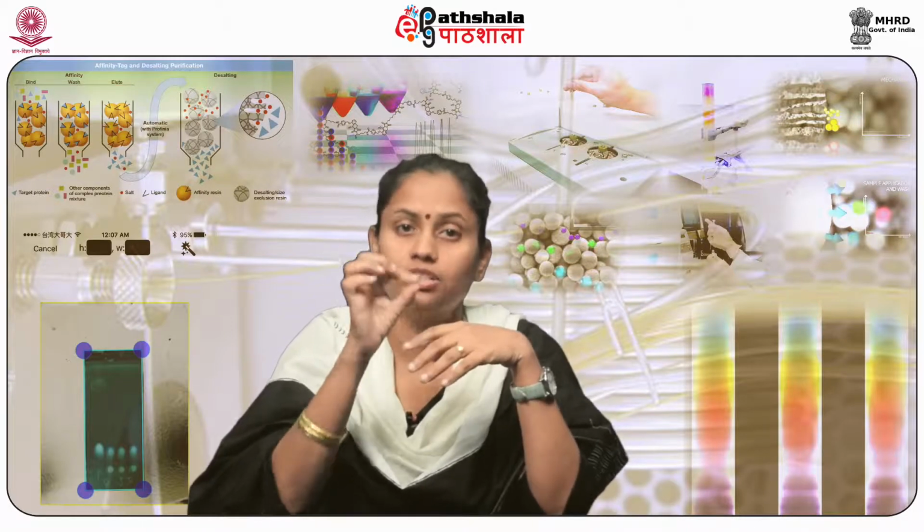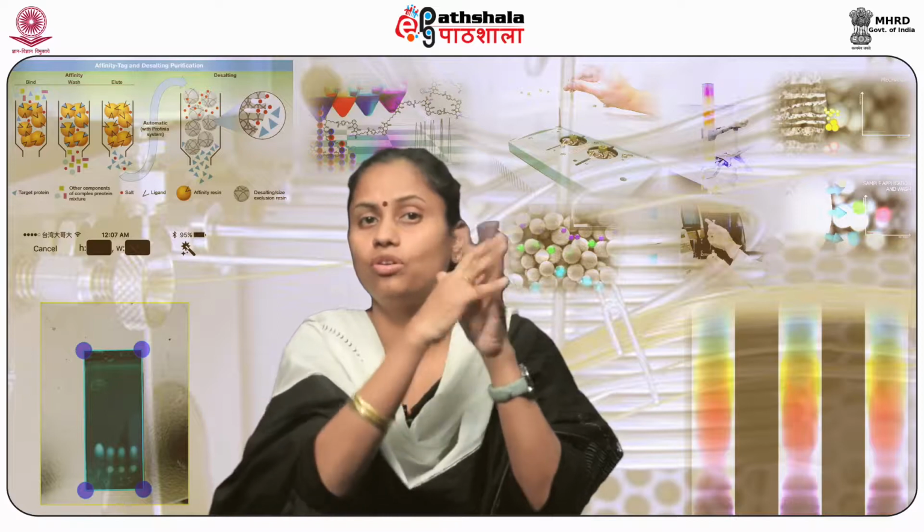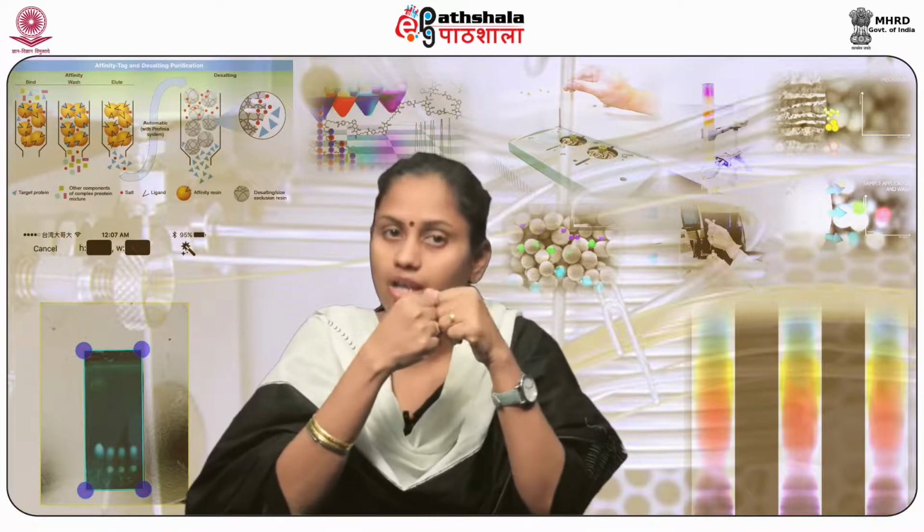The molecules with the lowest net charge at the selected pH will be eluted first from the column as ionic strength increases. In a similar fashion, the molecules with the highest charge at a certain pH will be most strongly retained. These will be eluted last.